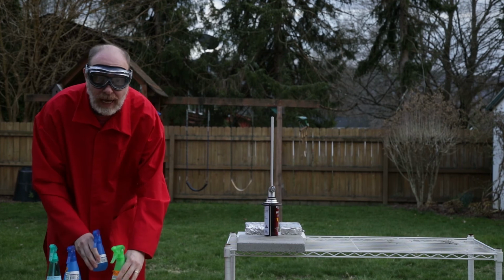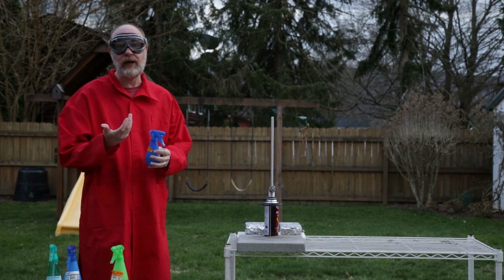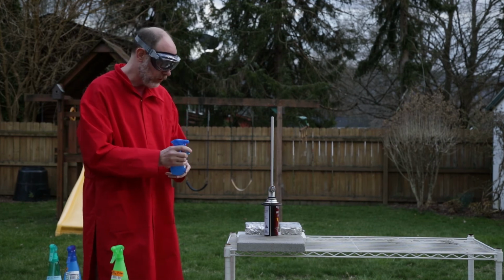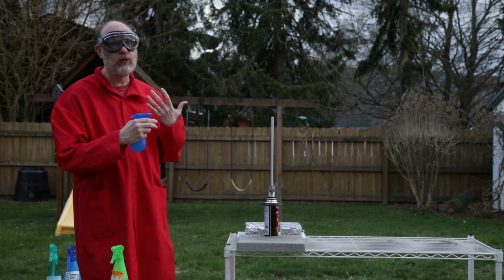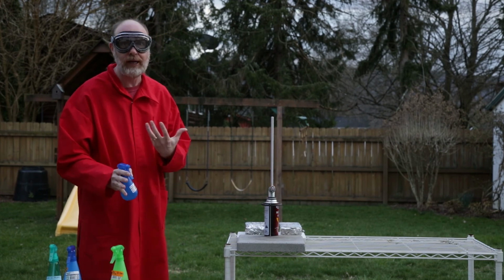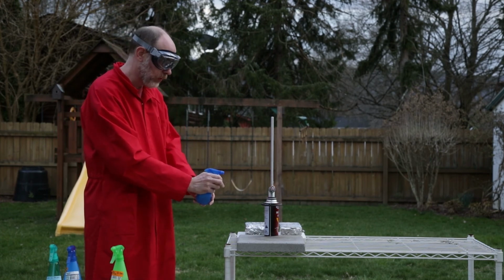Now we'll move on to a yellow or an orangish color. That comes from sodium chloride. That's just plain table salt dissolved in methanol. And it'll produce a really bright, brilliant orange color. It's really intense, more intense than the green that we see from the boric acid.